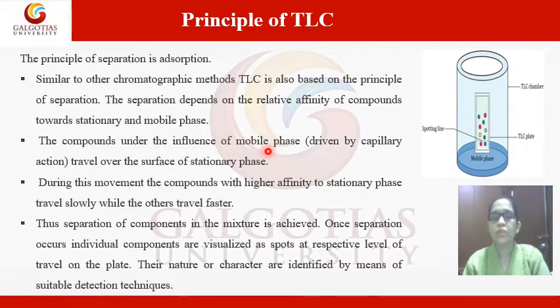Separation of the compound also depends upon the polarity of the mobile phase. In a mixture there are a variety of compounds, non-polar compounds and polar compounds. Like dissolves like, so if we take non-polar solvents, what will happen?